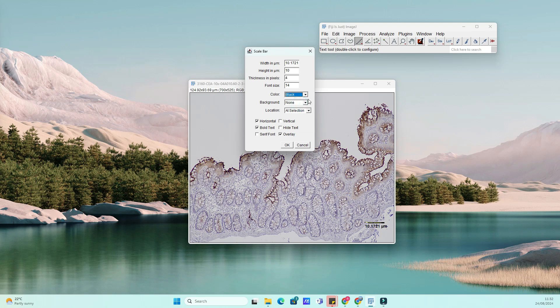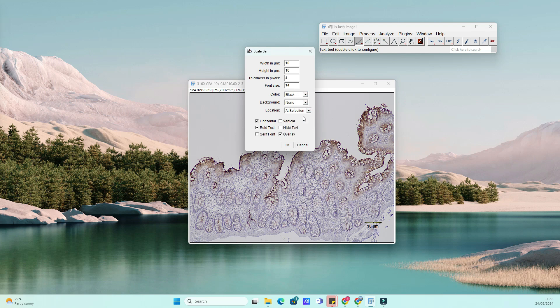The Scale Bar window will pop up, and here's where you can customize your scale bar. You can set the bar's length, which will automatically be adjusted based on the scale you've set. You can also change the color, location, and thickness of the bar. Once you're happy with the settings, click OK and the scale bar will be added to your image.